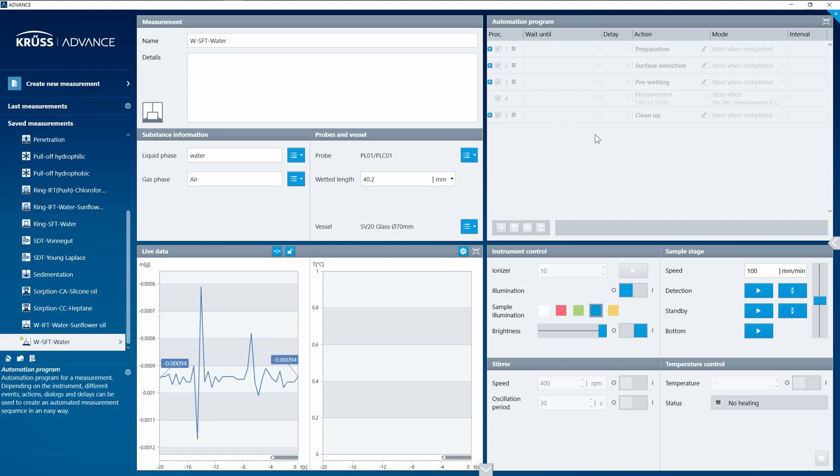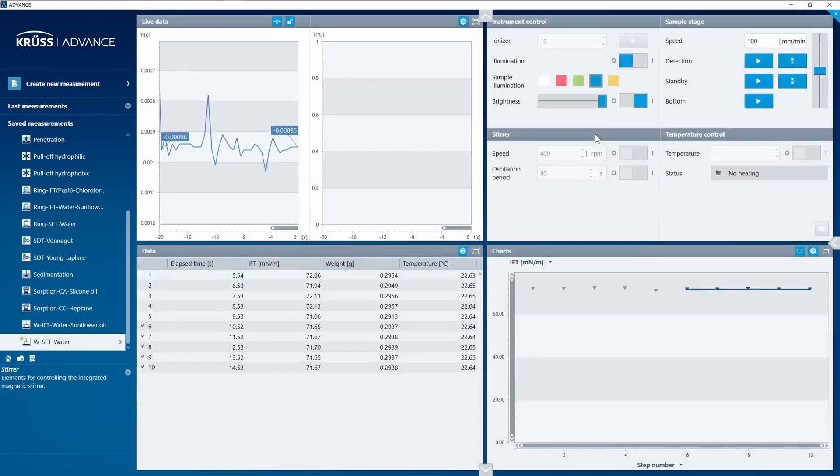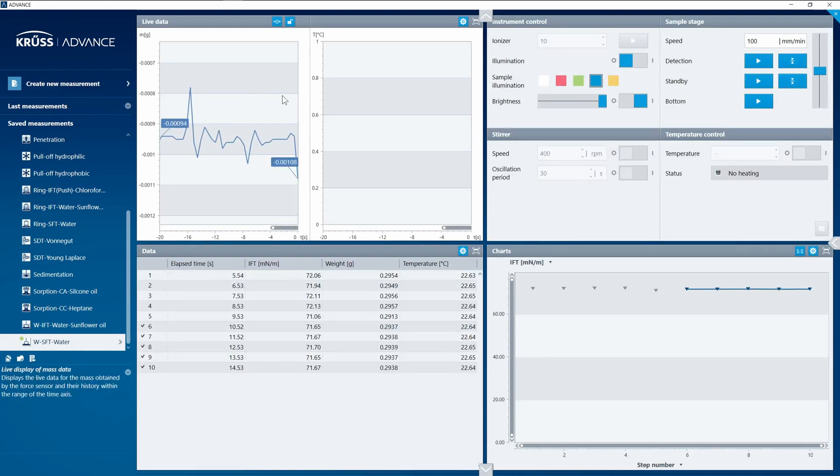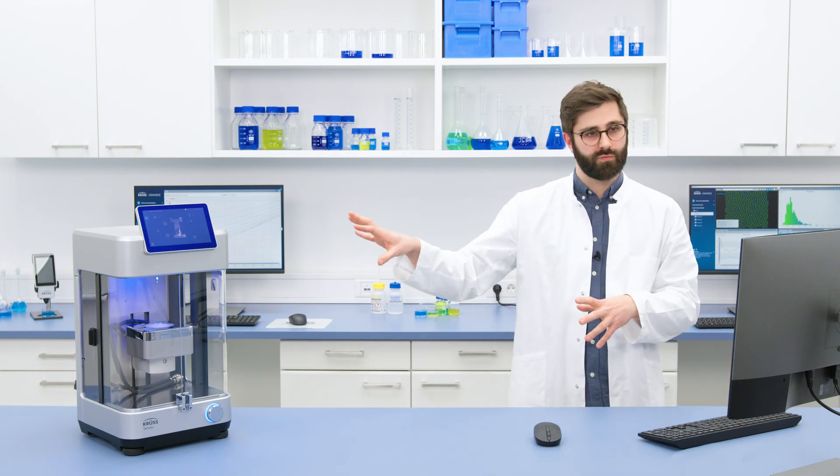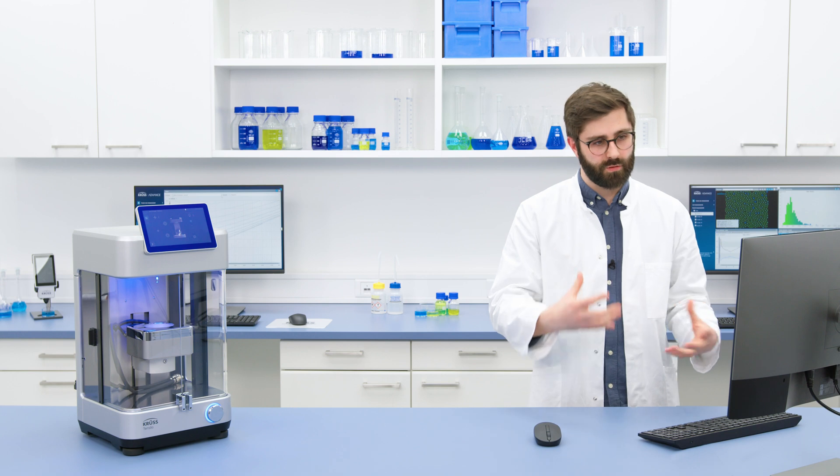Then you move to the right and you work your way down through the automation program, which tells the instrument how it should measure. You have a readout of the live data here, and on the right side here you have all of the controls that you saw before on the touchscreen. So you can control all the different functions of Tensio directly from the software as well.